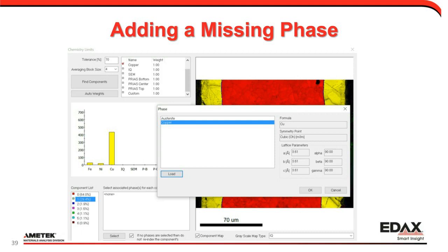Now, the main thing is that it does change the basic geometry of your EDS interaction volume. With a tilted sample, the interaction volume becomes more of an elongated teardrop. So I can get a little bit of what we call EDS shift in my data. Usually not that big of an issue. Now, the question, of course, would be when talking about quantitative EDS data.